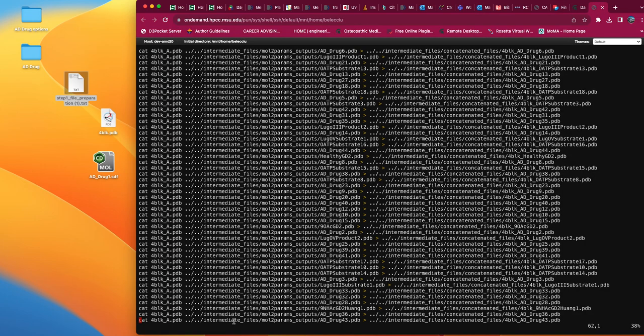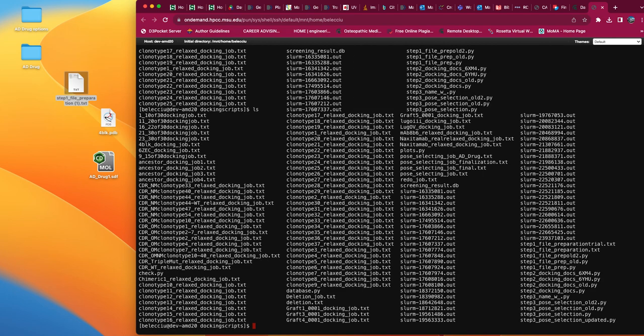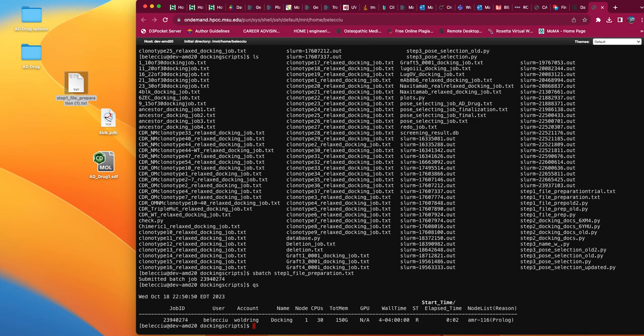Okay, so now we can actually run that command. Okay, and it should take, for this, I would say maybe 20 seconds at most.